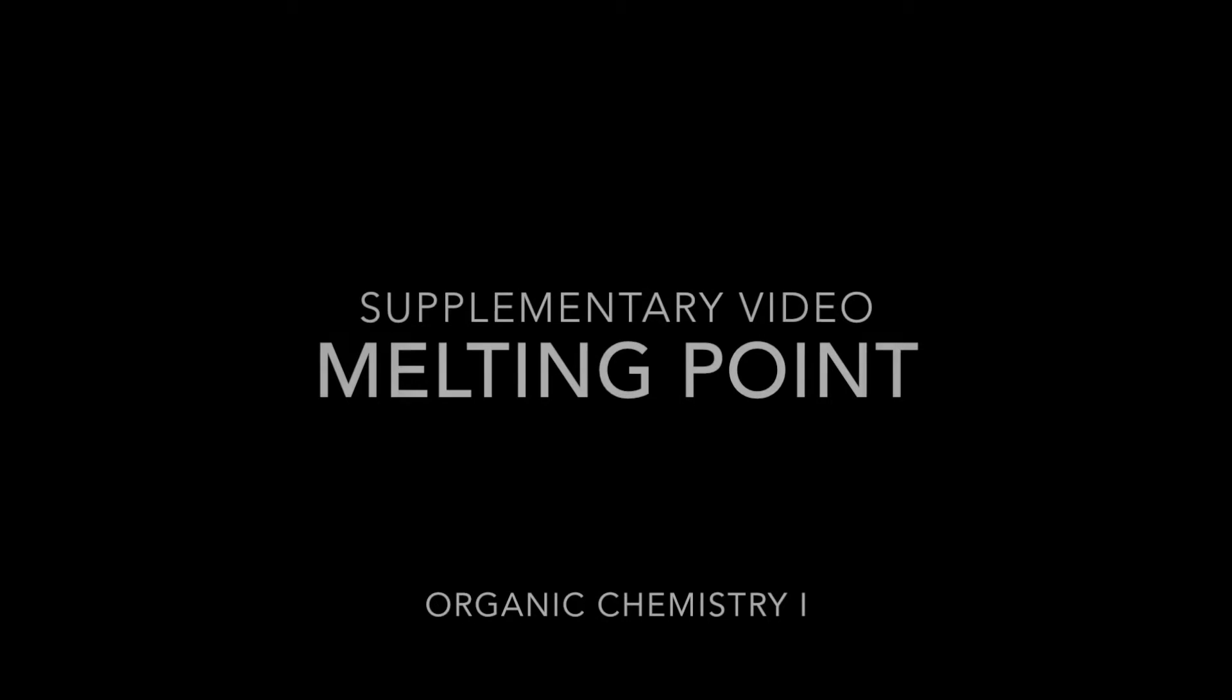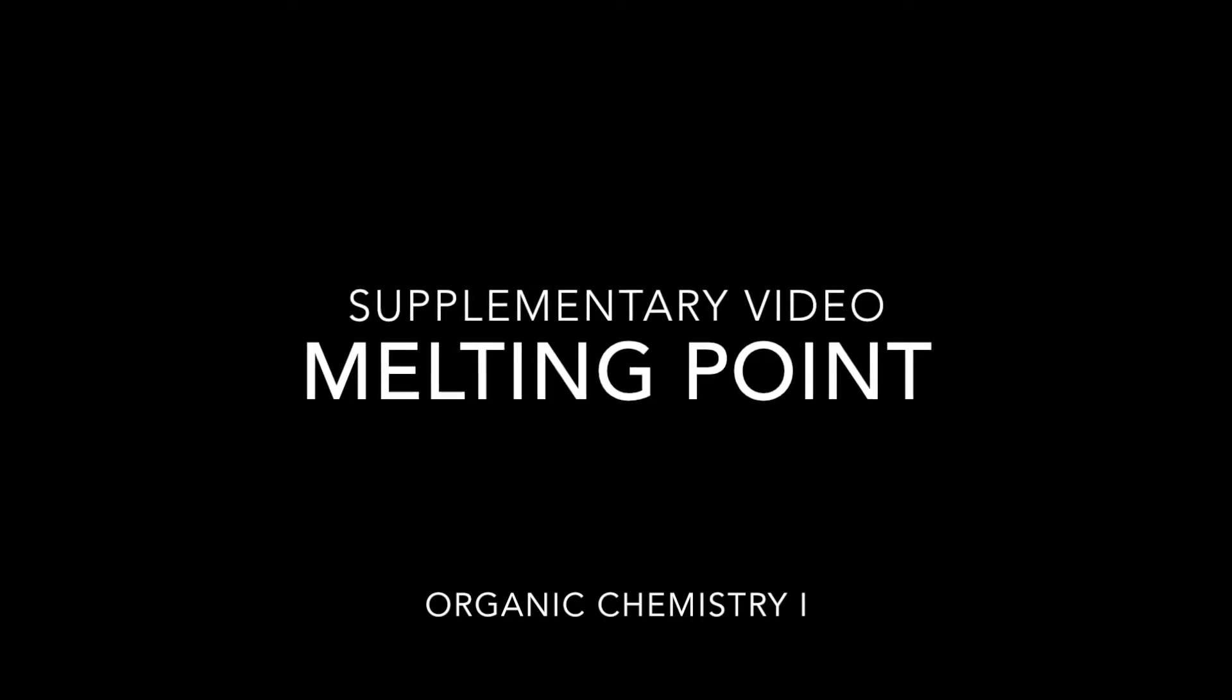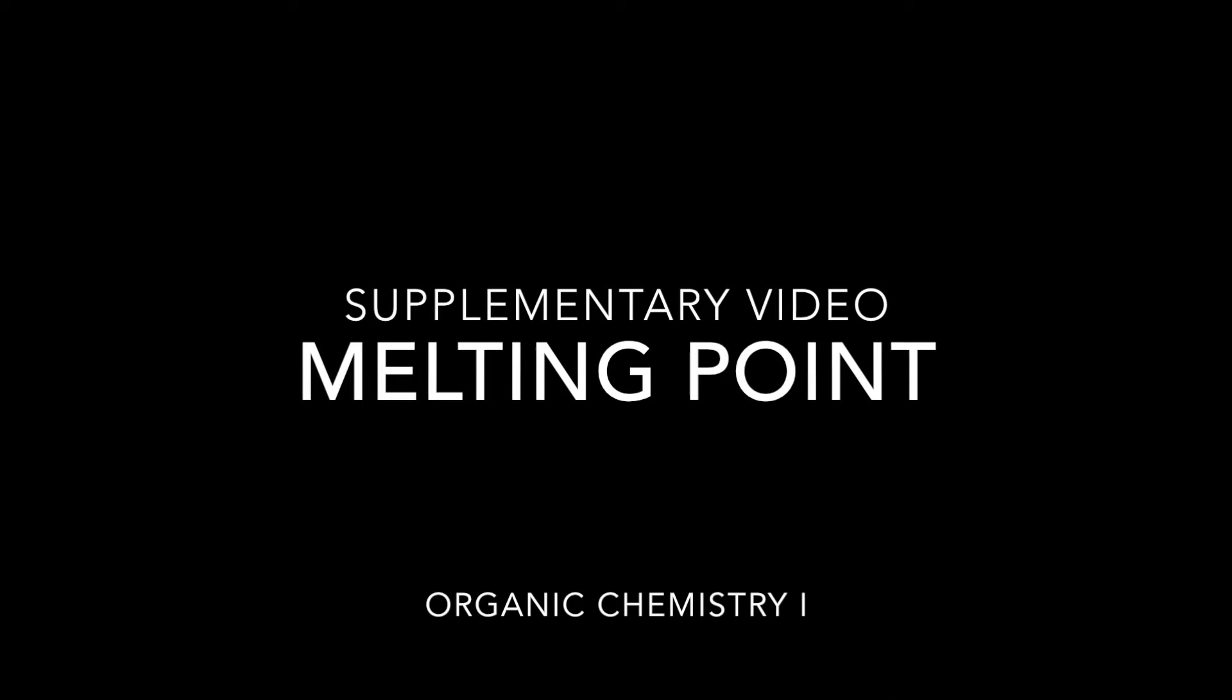Supplementary Video: Melting Point Determination. Use of Melting Point Apparatus. In this video, Bivia will show how to load and pack capillary tubes with solids and how to use the melting point apparatus, both analog and digital, for the determination of melting point ranges.